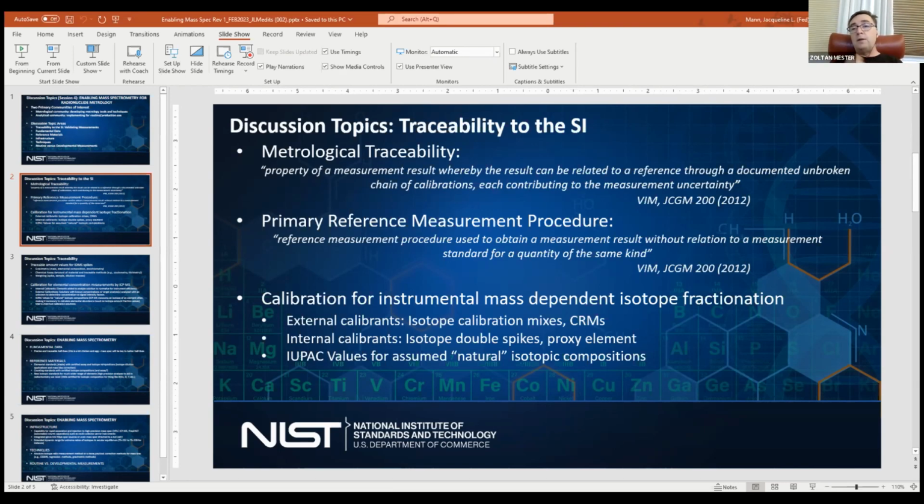Those are the standards that Jackie described, the mass fraction or mole fraction standards from NIST, which are used for some other purpose, but they represent the physical material which is available to everybody, and communities often use those materials, as secondary or off-label use, to normalize their isotope measurements against, with all the caveats that were described: once a new series is released, that might not be the same point.